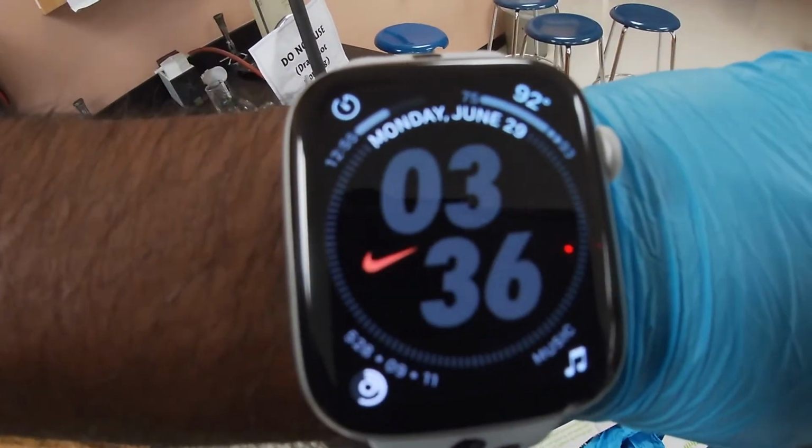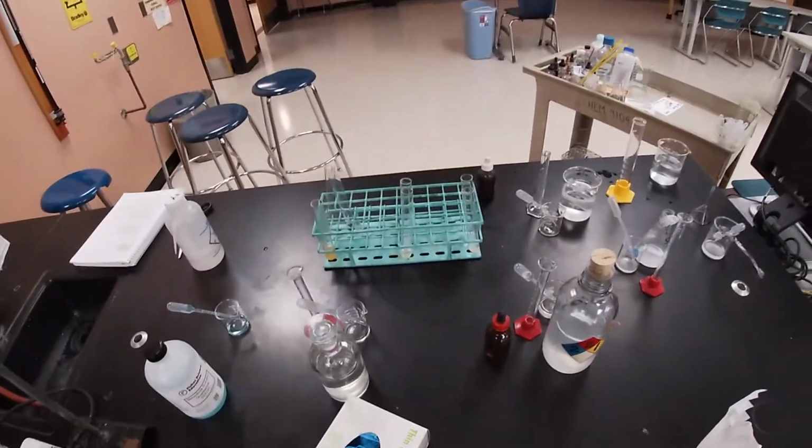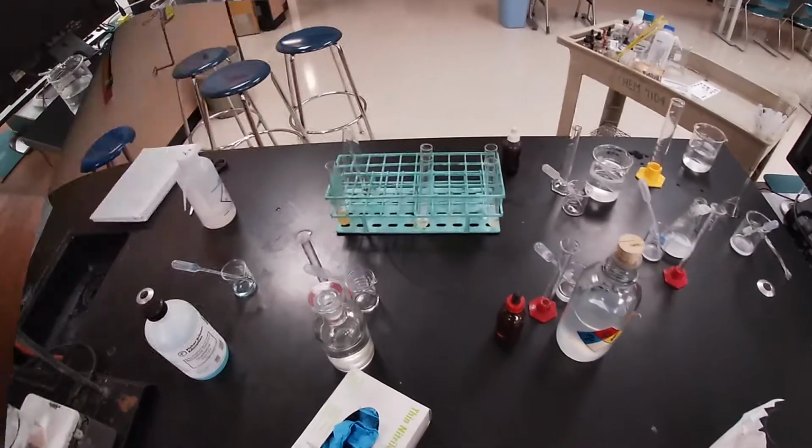We're still waiting. We're at about 12 minutes in. I'm sorry, more than 15 minutes in. We just need about 13 more minutes, and then we'll go ahead and take our next sample and determine the presence of those 3 constituents, okay?